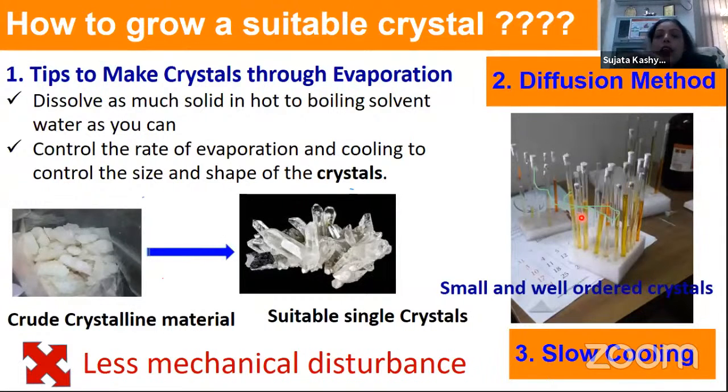The tube which I have shown you is a crystallization tube. It's similar to an NMR tube, but I would suggest you do not use your NMR tube. That NMR tube is made of quartz, whereas this tube is made of borosilicate or something, so it is not expensive. Those NMR tubes are very expensive. Don't use an NMR tube for crystallization purposes, otherwise your supervisor will kick you out of the lab.